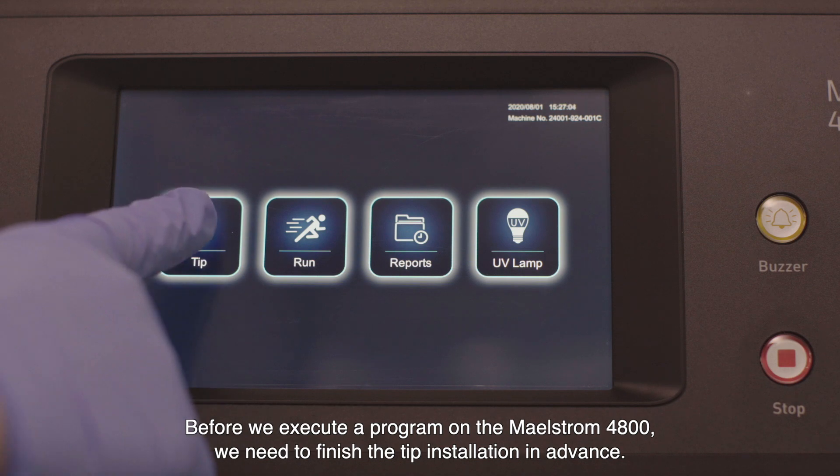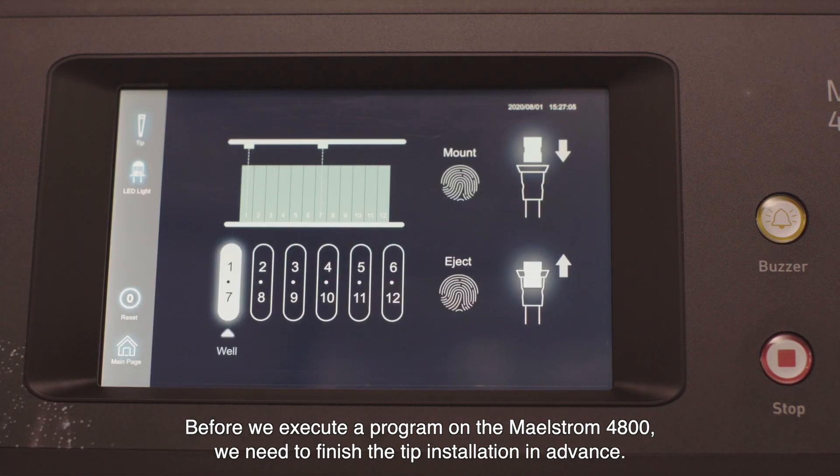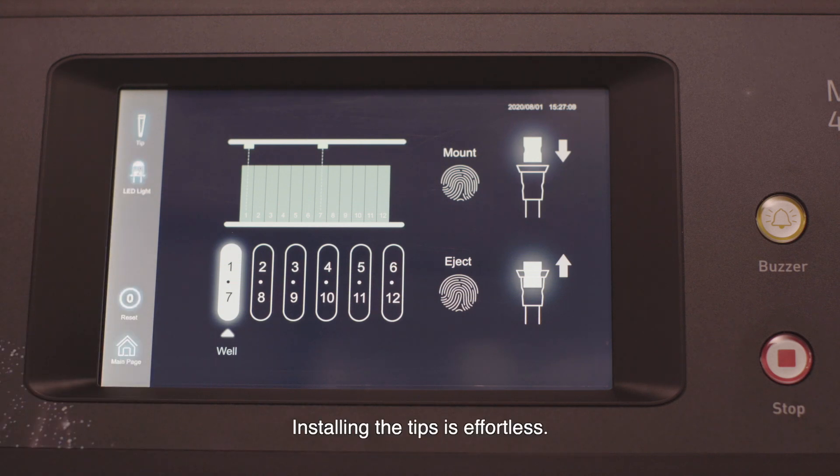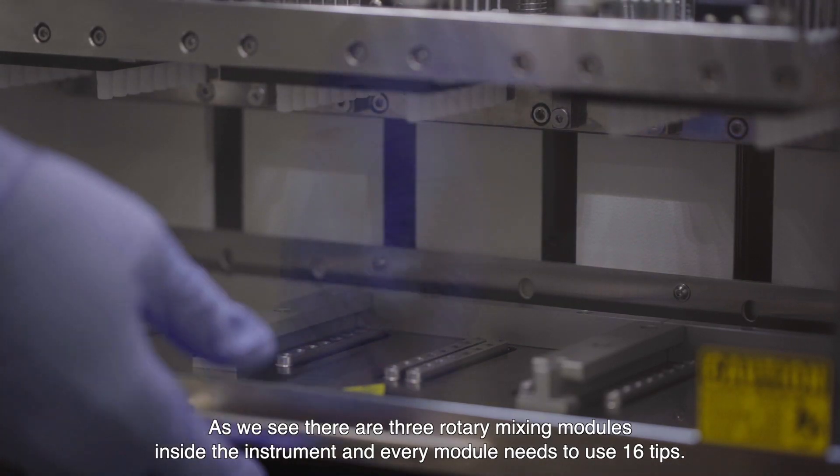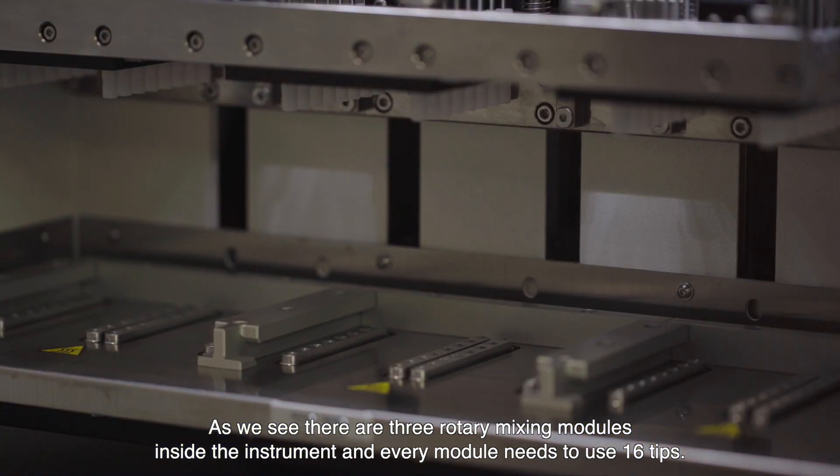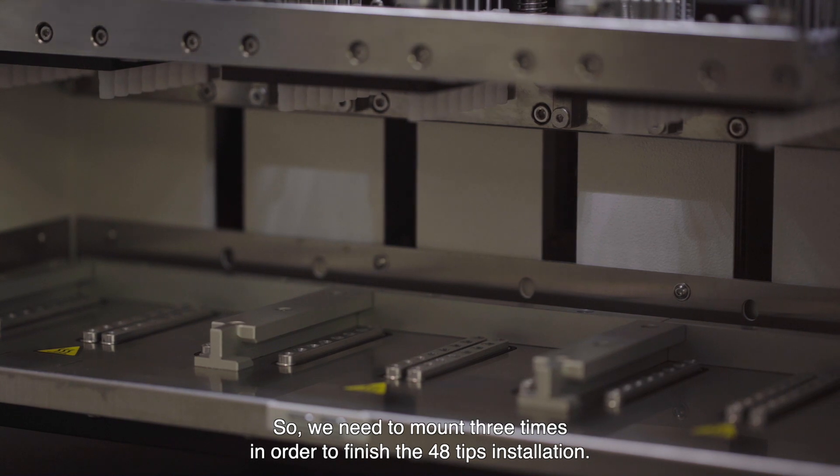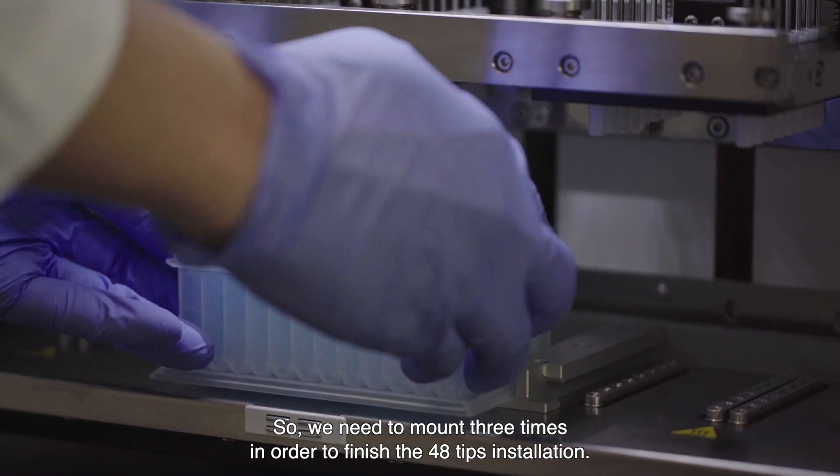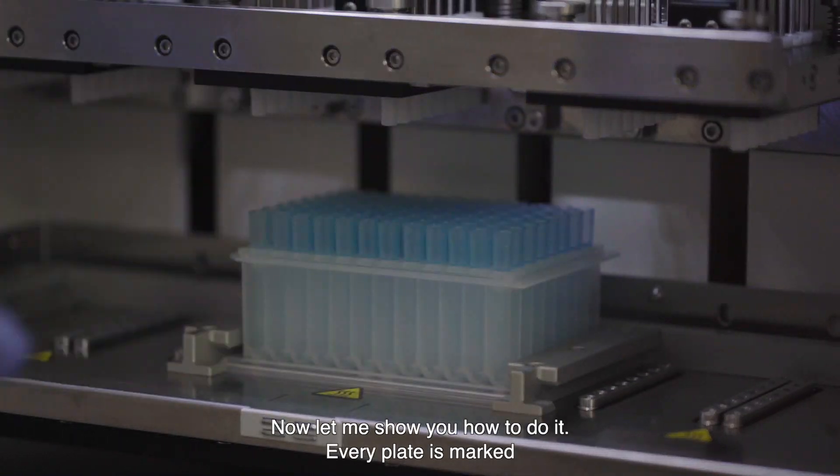Before we execute a program on the Maelstrom 4800, we need to finish the tip installation in advance. Installing the tips is effortless. There are three rotary mixing modules inside the instrument and every module needs to use 16 tips. So we need to mount three times in order to finish the 48 tip installation. Now let me show you how to do it.